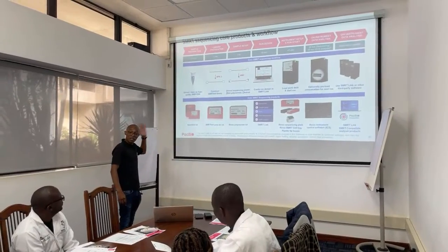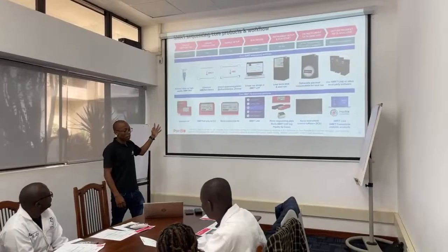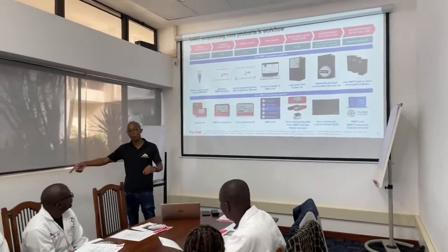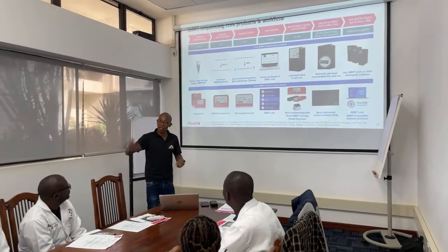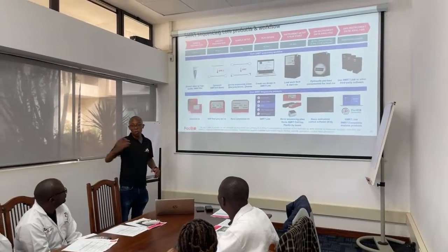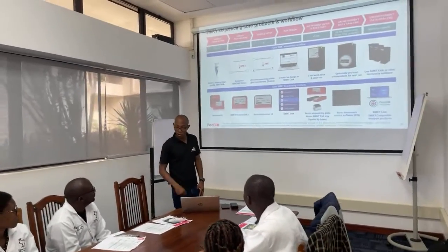We're going to do extraction. It's quite long. Hopefully we'll be able to finish, and at the very best do shearing, and then it can run overnight, so that when you come back tomorrow you can start with the actual library. It's quite long, and the more you incubate, the more chance you have of extracting very good DNA.